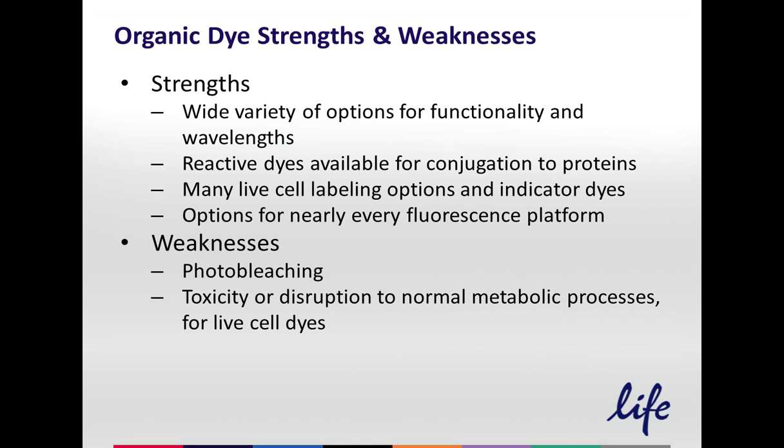And some dyes will photobleach very quickly under certain circumstances, others not so bad. Now you can mediate this by reducing the light, or, for fixed samples, you can use an anti-fade mounting media, which has components that will slow that photobleaching. But it's almost always something you need to keep in mind as a potential problem.